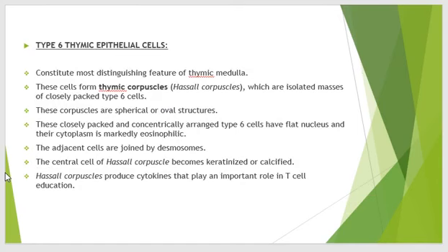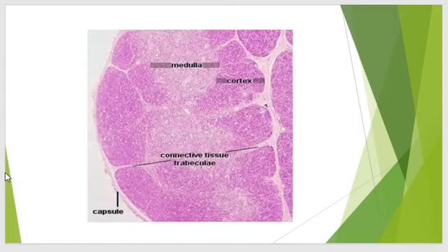Type 6 thymic epithelial cells are the most important and constitute the most distinguishing feature of the thymic medulla. These cells form thymic corpuscles, also called Hassal's corpuscles. Hassal's corpuscles are isolated masses of closely packed type 6 cells — spherical or oval structures that are concentrically arranged. Type 6 cells have flat nuclei and markedly eosinophilic cytoplasm. Adjacent cells are joined by desmosomes, and the central cell of Hassal's corpuscles becomes keratinized or calcified. These cells produce cytokines that play an important role in T cell education.